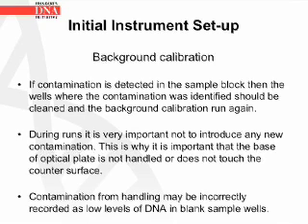During runs, it is very important not to introduce any new contamination. This is why it is important that the base of the optical plate is not handled or does not touch the counter surface. Contamination from handling may be incorrectly recorded as low levels of DNA in blank sample wells.